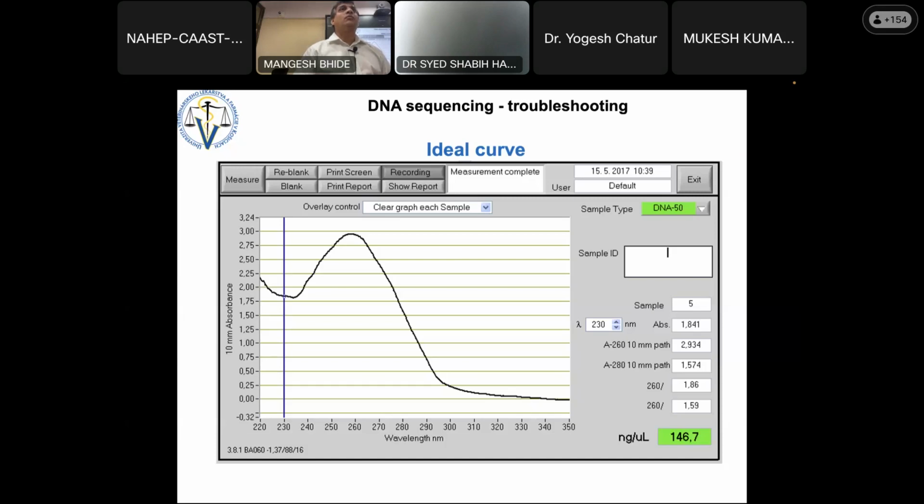You are saying for DNA, not PCR product. No, sir, for DNA. DNA 600 is okay. We used to get that. No, here we are covering the PCR product. For PCR product, sir, we always got around 100. That is too much. We used to get 100. We got it because we had to write it in our thesis, so I clicked all the pictures. Okay, so if you have 5 nanograms, it is very good.